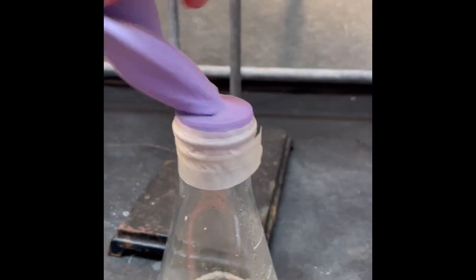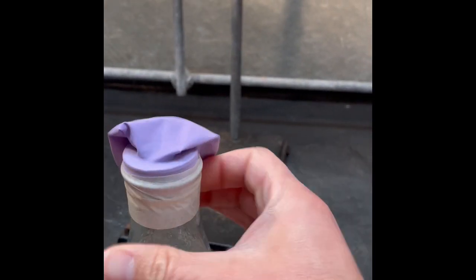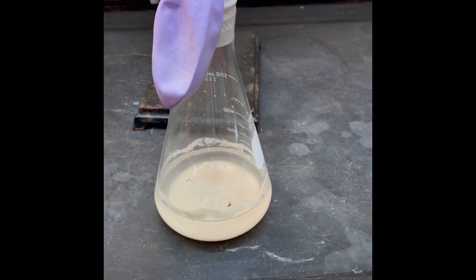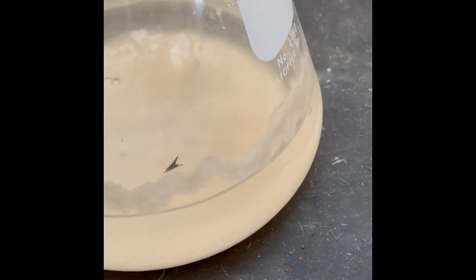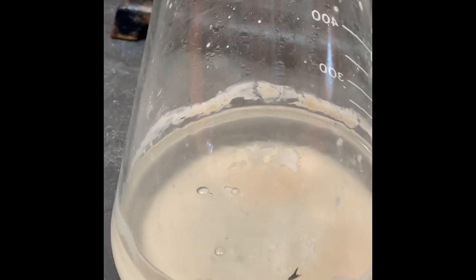What you want to do is inspect for some holes. I don't really see any obvious holes here, so that's good. You can still squeeze it and form a little bubble there. So let's see what we can get out of this. You can see some bubbles on the top, so that's cool. It looks like we're still evolving gas, maybe just not a crazy amount to force that to inflate significantly. Let's check it out though.